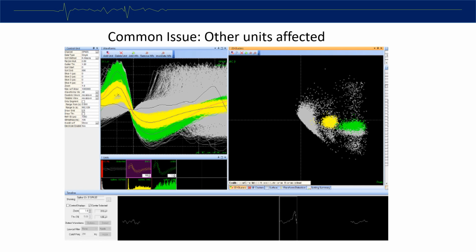Fortunately, most modern acquisition systems allow for the continuous unthresholded signal to be saved. One benefit of this is it allows for the user to re-threshold the data offline. For these examples, doing so with a threshold further away from the noise floor would ensure less jitter and tighter clusters, which will make for better sorting results.